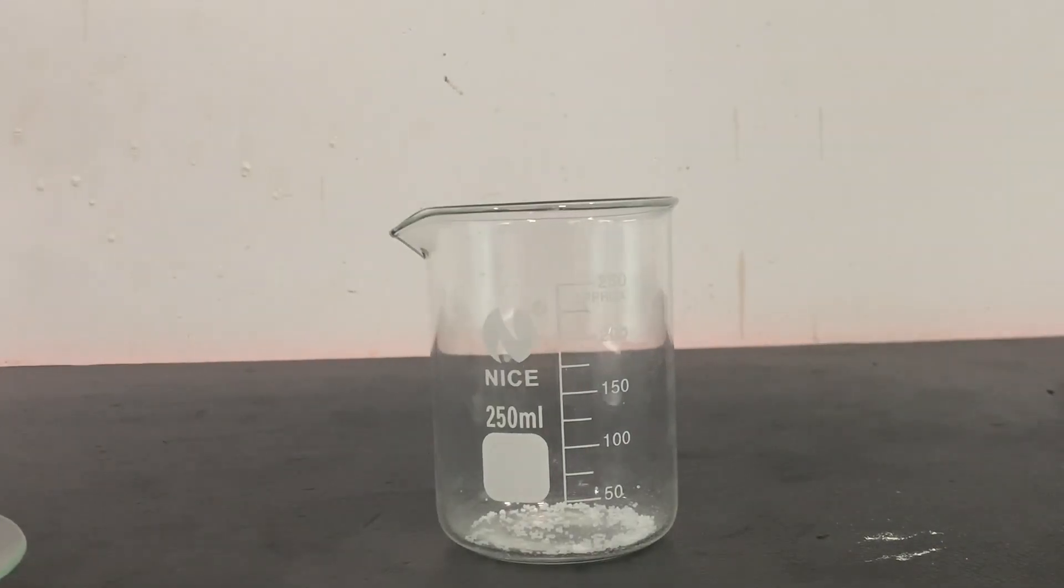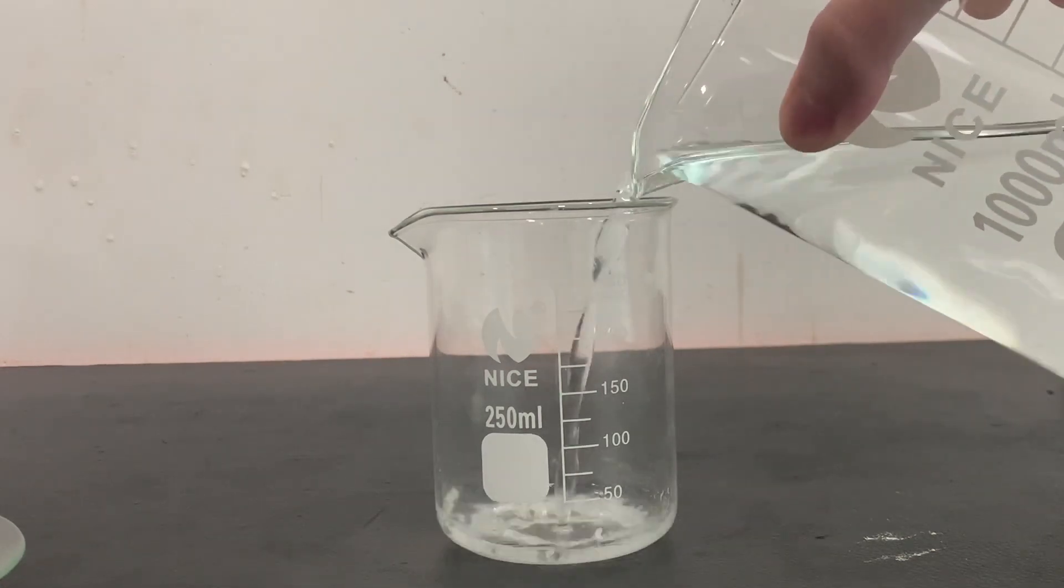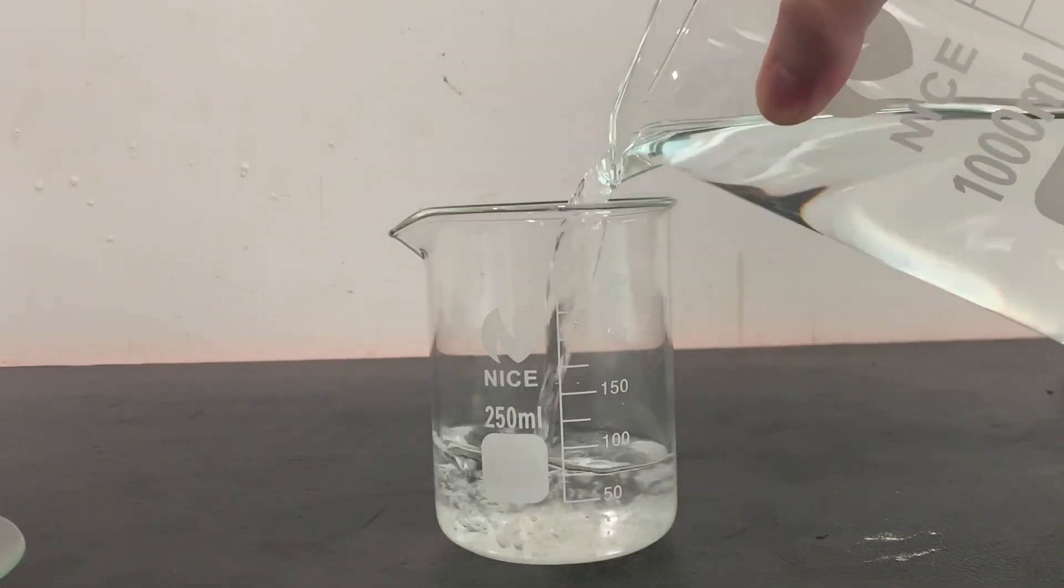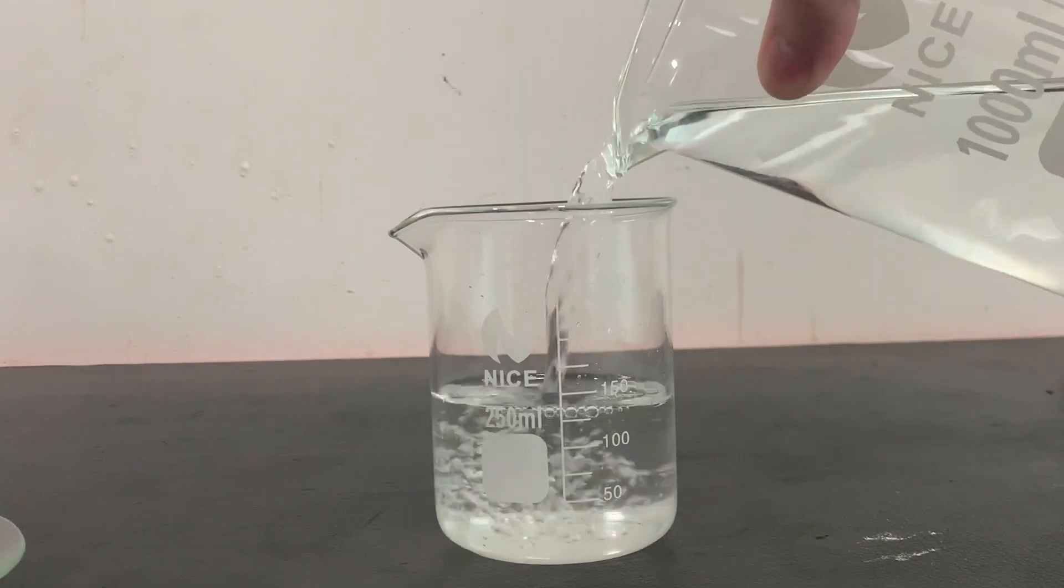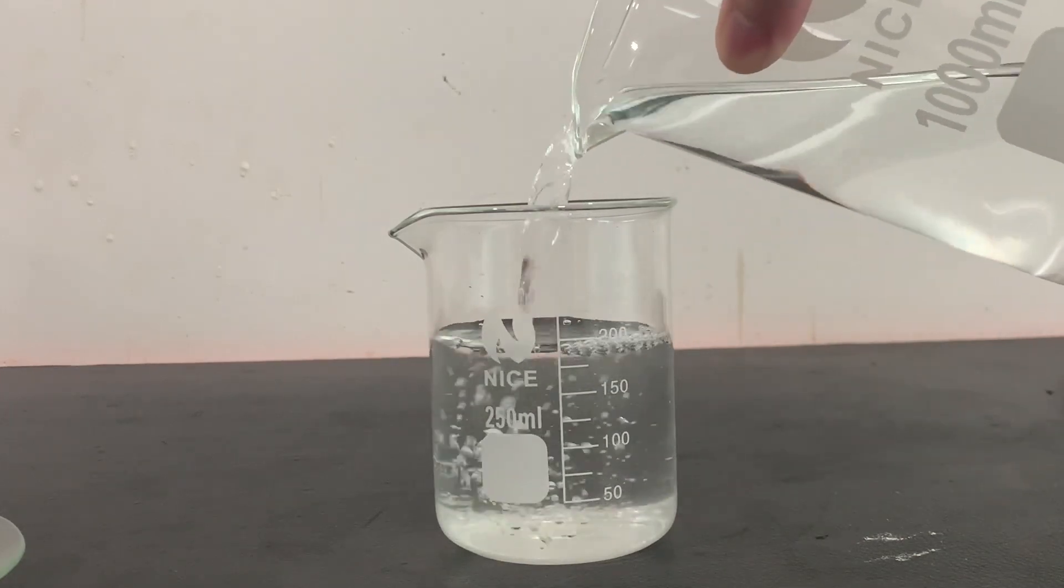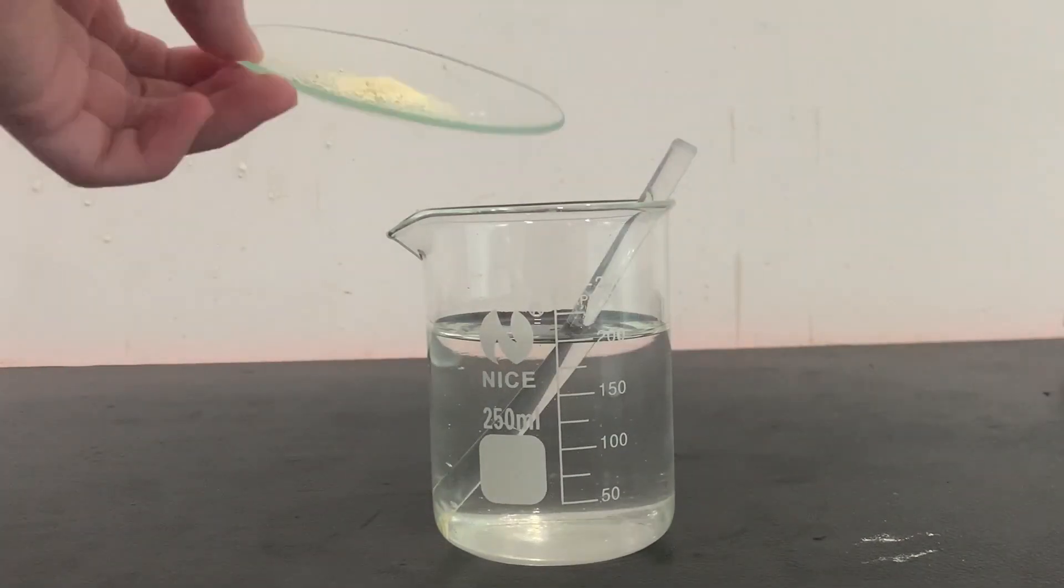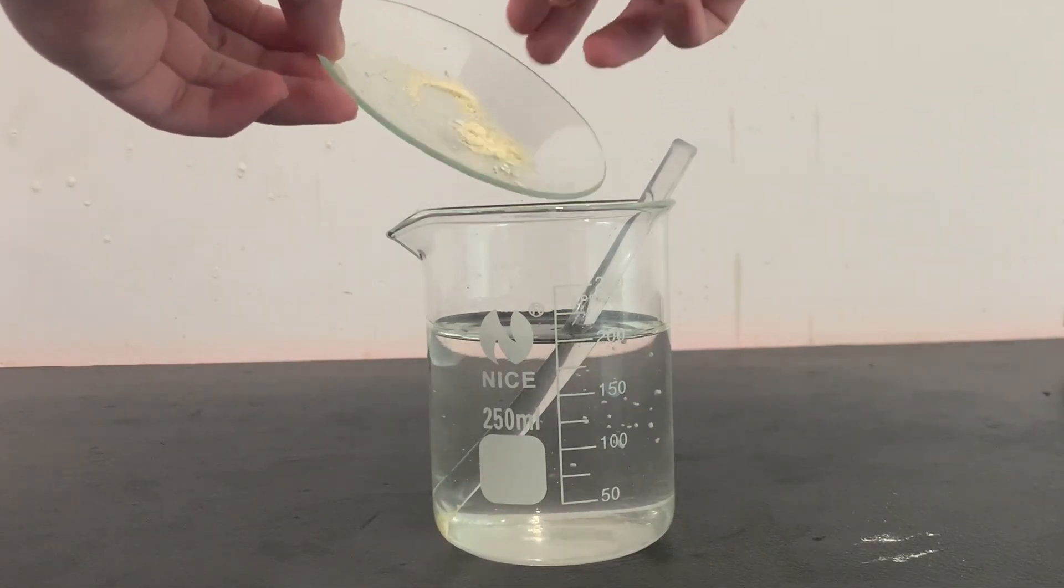To demonstrate the chemiluminescence of luminol, I firstly made the basic solution by dissolving 0.8 grams of sodium hydroxide in 200 milliliters of water. I then added all of the luminol I had made to the solution.